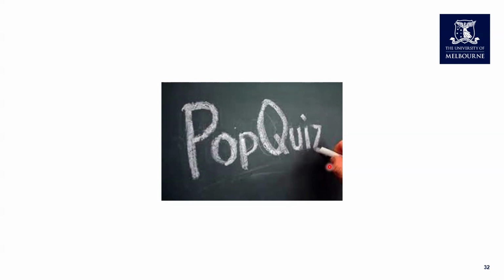So the question was, which features can be improved during pre-processing steps? The first one is signal to noise ratio. Yes, we can increase the signal to noise ratio. We can pretty much reduce noise using those noise reducing filters, Gaussian, median filters. And also we can do this using the deconvolution method.